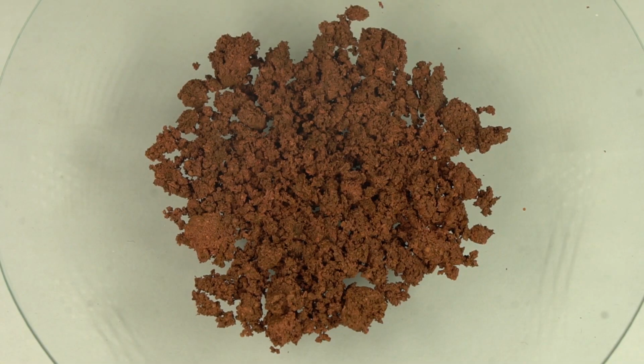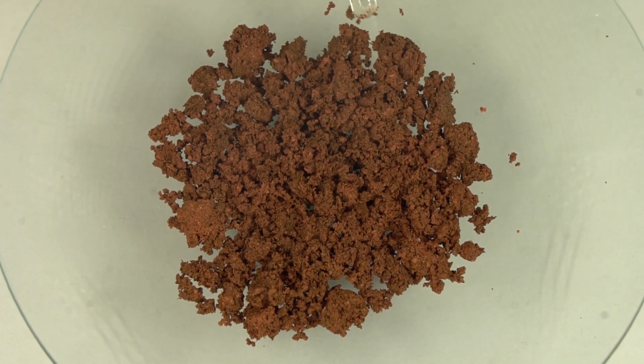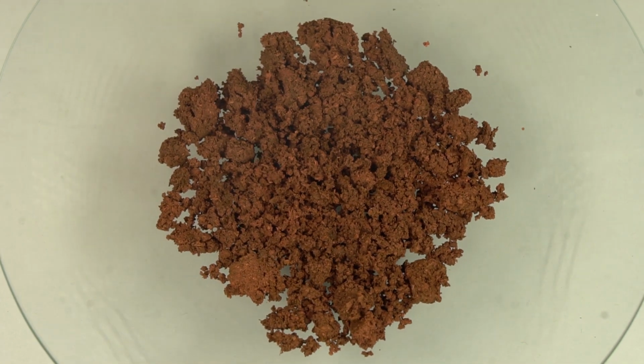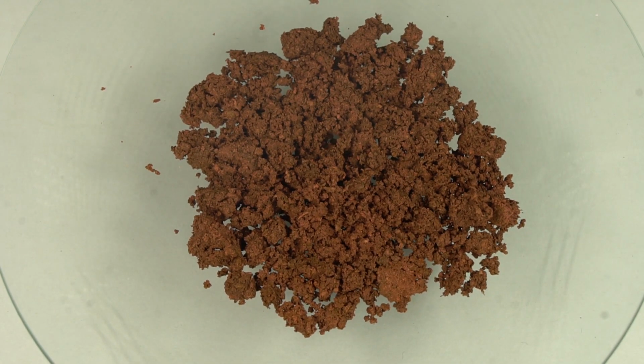I used a plastic spoon and I transferred the copper into this watch glass, and wow, it is so beautiful. It is such a gorgeous red brown. I feel like this is like an art exhibit. I just want to spin it around like that and just look at that. It's just amazing.